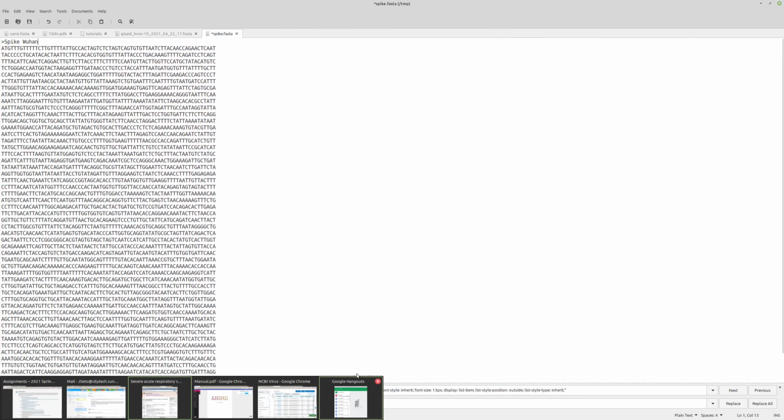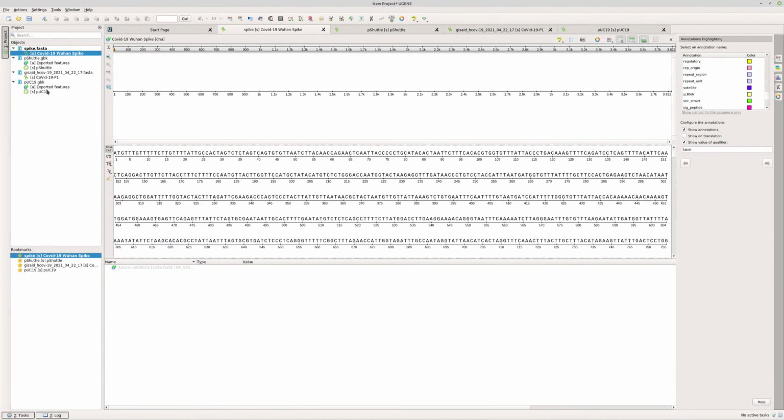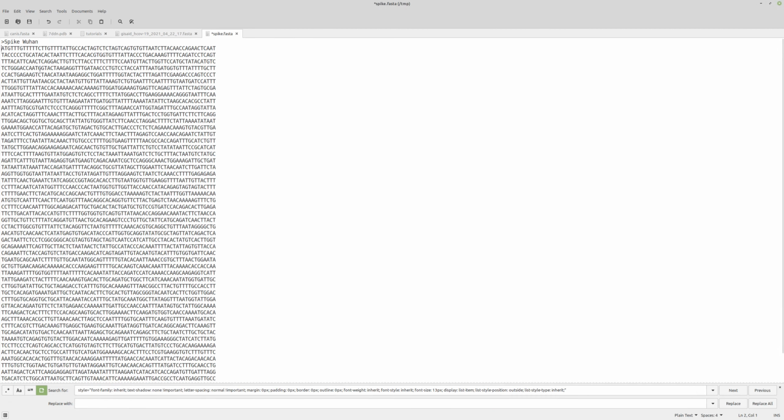And then subsequently, what we're going to want to do is understand what that restriction site is that we want to add to it. So once again, let's go back to our pUC19, and we'll find where it says SalI, because once we find SalI, it is here. And we can see that sequence is GTCGAC, right? So that's what's over there. GTCGAC. Notice I put it in a different case just so I can recognize my modification to it. And remember, the FASTA just treats this all as one contiguous sequence, so that's fine that there's spacing issues here.